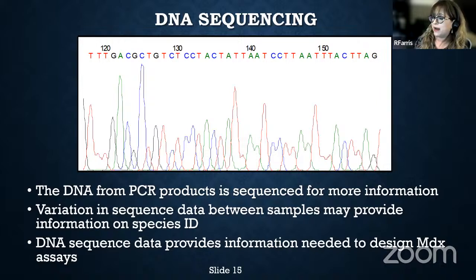Now, someone might ask, well, why don't you just go to the sequence data to begin with, if you're getting the most accurate data there? I mean, that is the data. Why don't you just go to sequence data to do your species ID? Well, we do sometimes, when there's actually no molecular diagnostic tool out there. Sometimes all we have to do is rely on the sequence data.